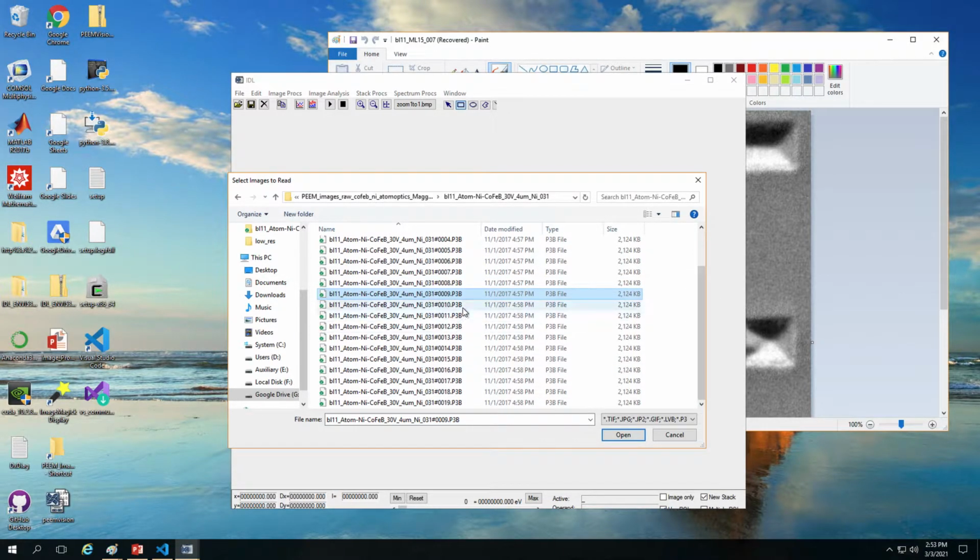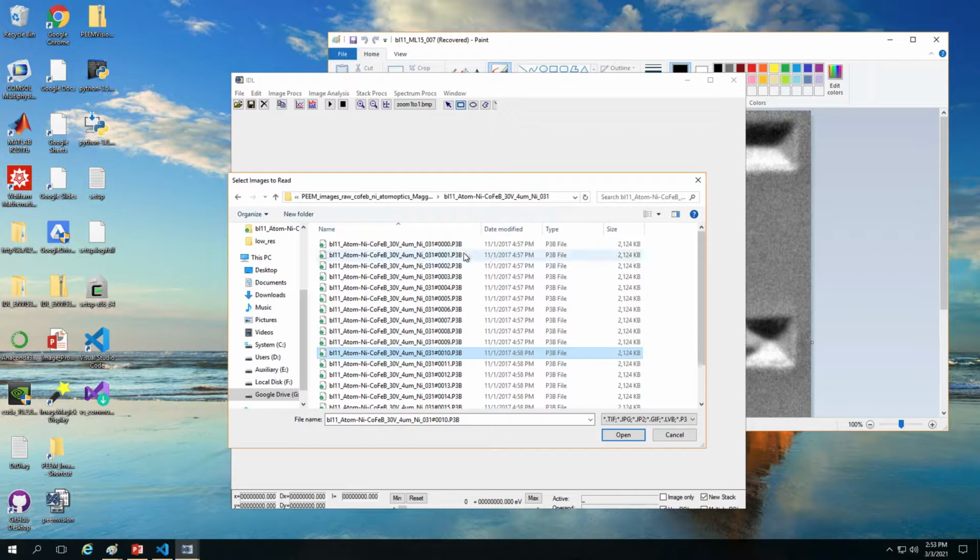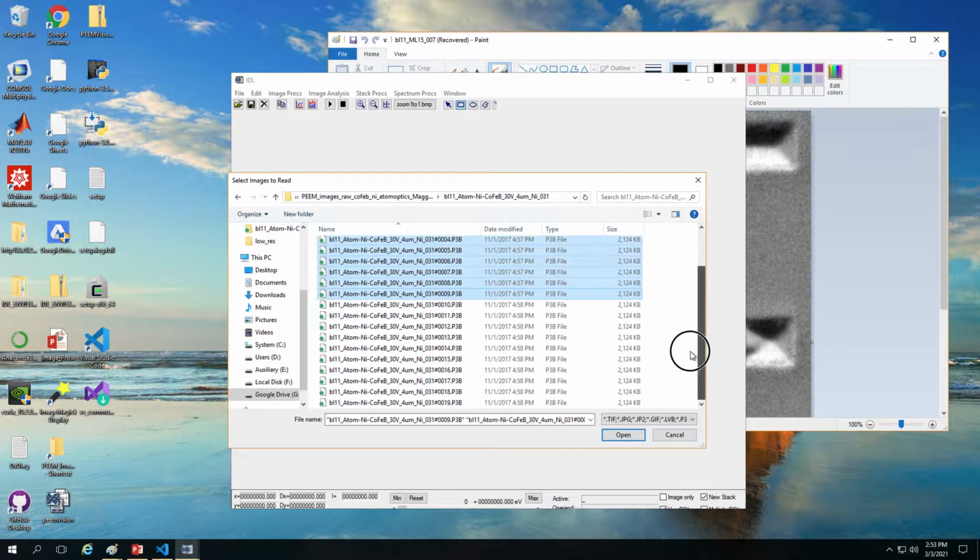And then the remaining 10 is done by right circularly polarized X-ray, the opposite direction in terms of circularly polarized X-ray, the opposite dichroism. So with this kind of processing, we could directly get an average of the images. We probably have an average of the left circularly polarized X-ray XAS, and then a right circularly polarized X-ray XAS. Then we take the difference, and that gives us our magnetic contrast, the so-called PEEM images.